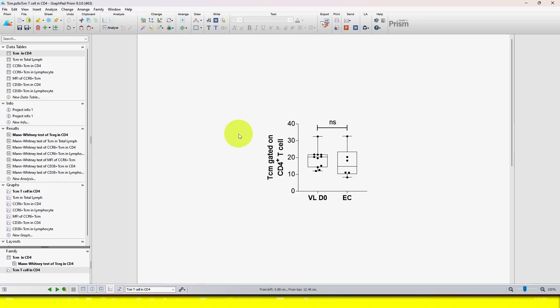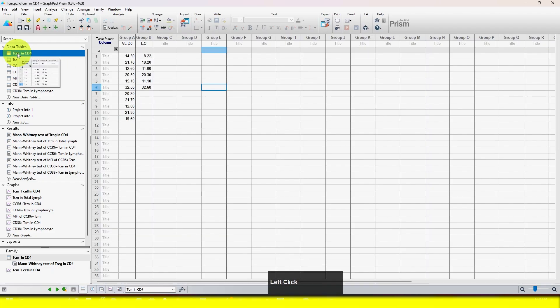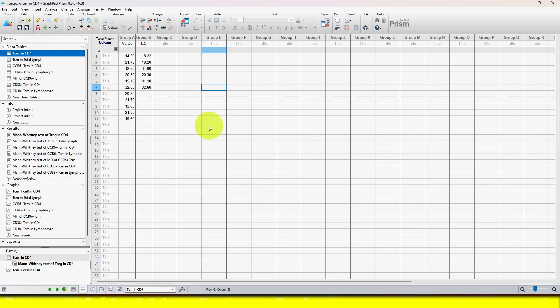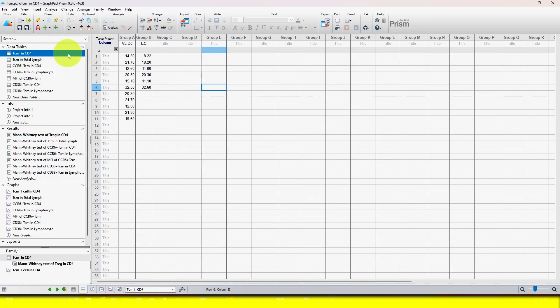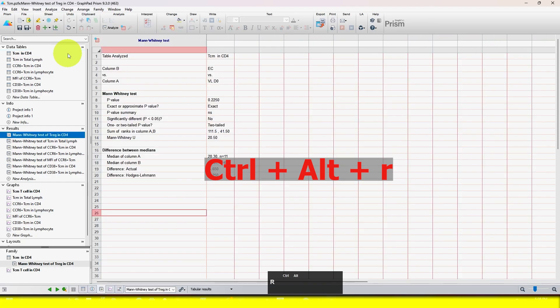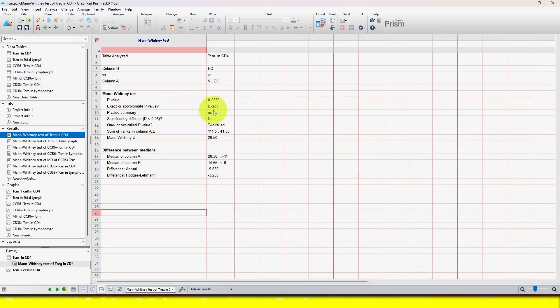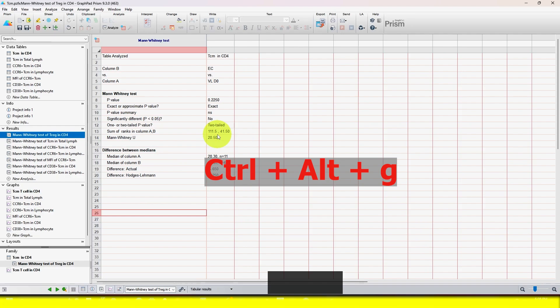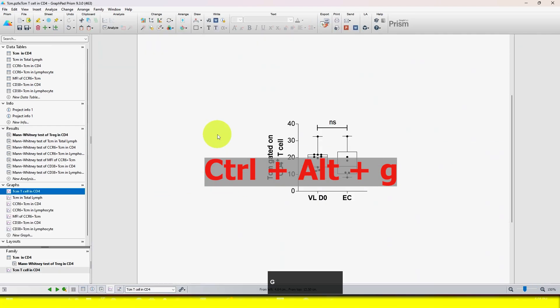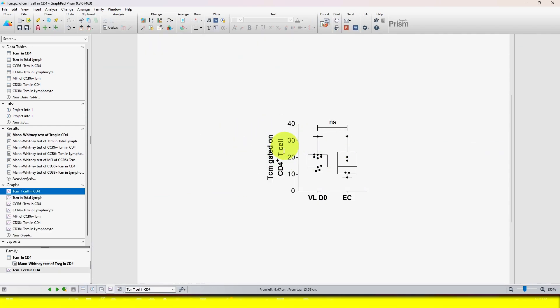The second method I want to show you is using keyboard shortcuts. There are three shortcuts you can use for the data table, result, and graph. If you want to see the result for a selected data table, you can use Ctrl+Alt+R and you will directly see the result. And for the graph, use Ctrl+Alt+G to see the graph.